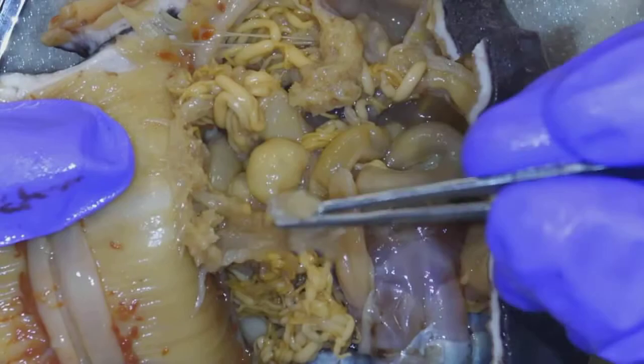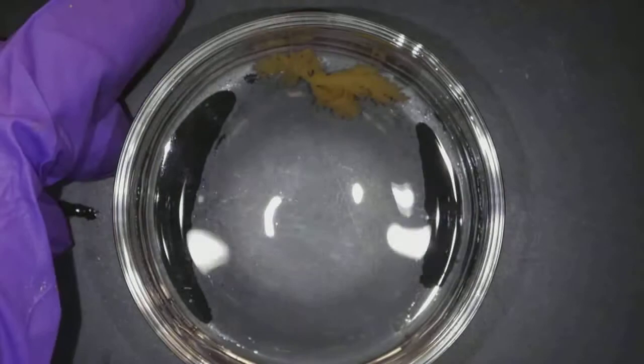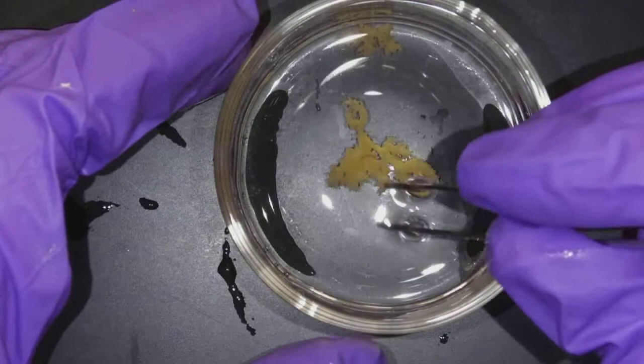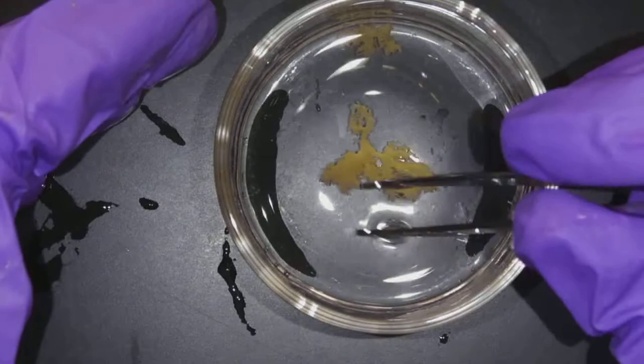To distinguish respiratory tree from gonads, you take some of it and float it in water. The camera wants to focus on the water surface — sorry about that — but you can see how it is very branched, like what a lung would look like on the inside. That branched structure is respiratory tree; I don't always recognize it until I float it in water.